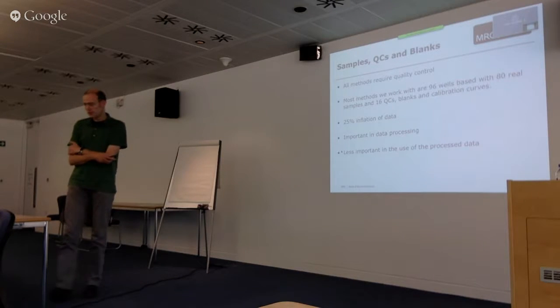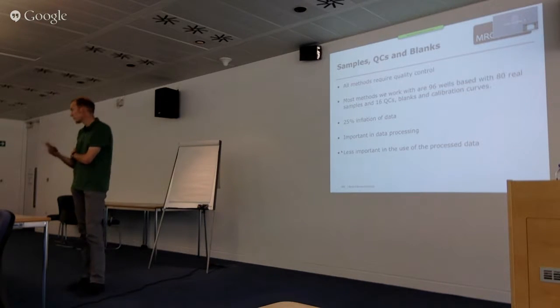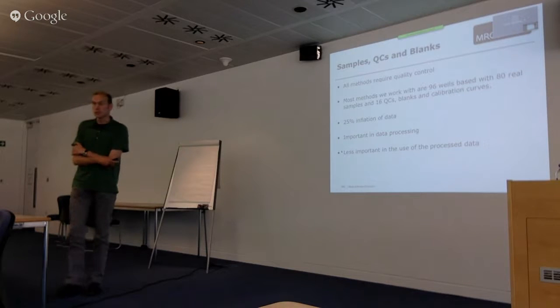With every analysis of the samples we're running QCs and blanks to maintain a full process.